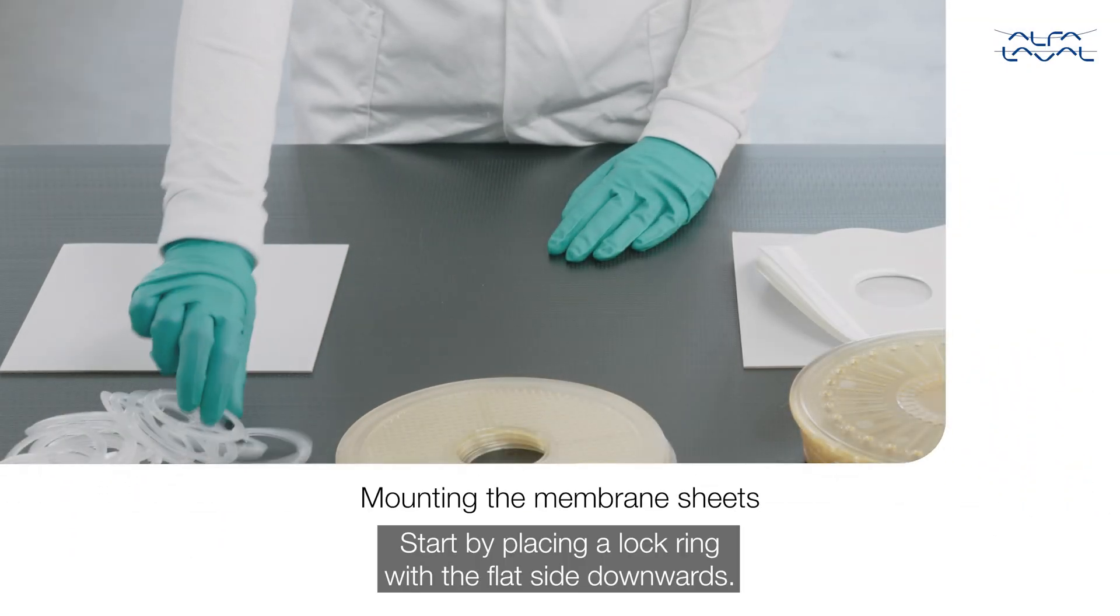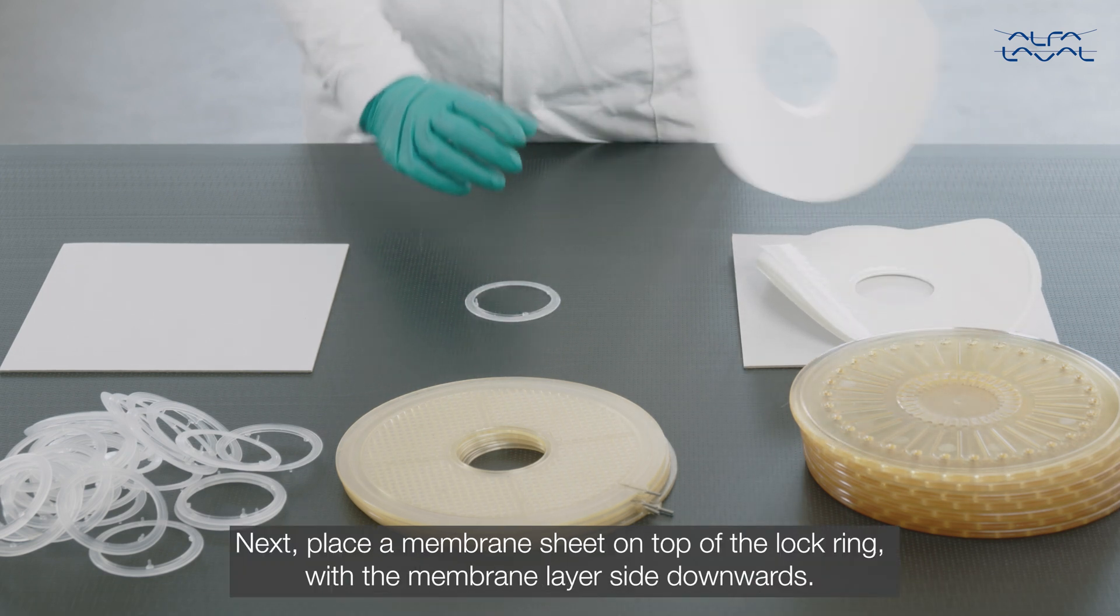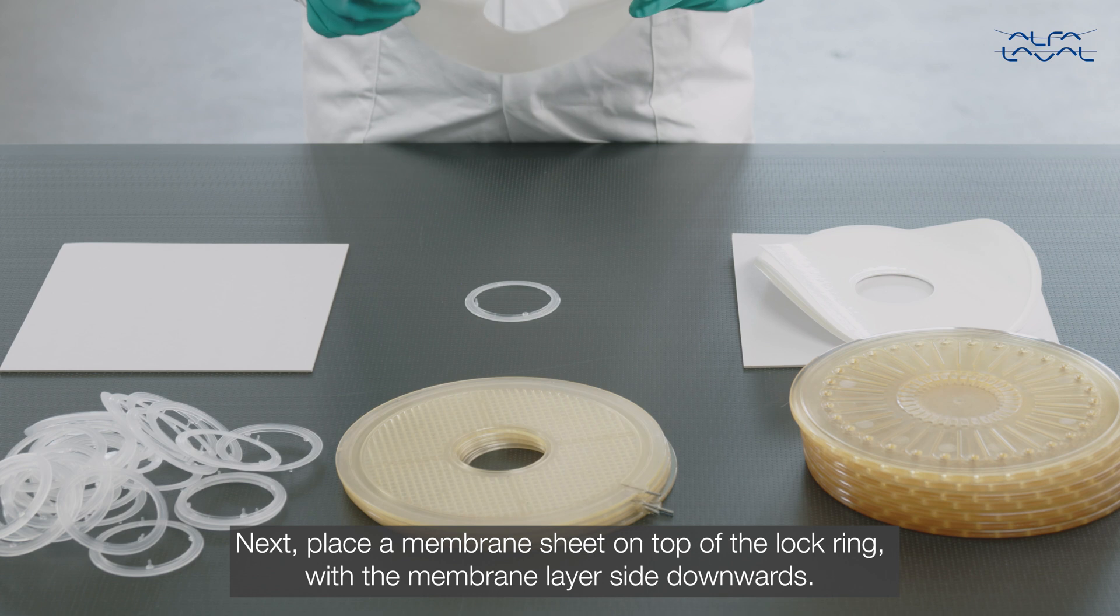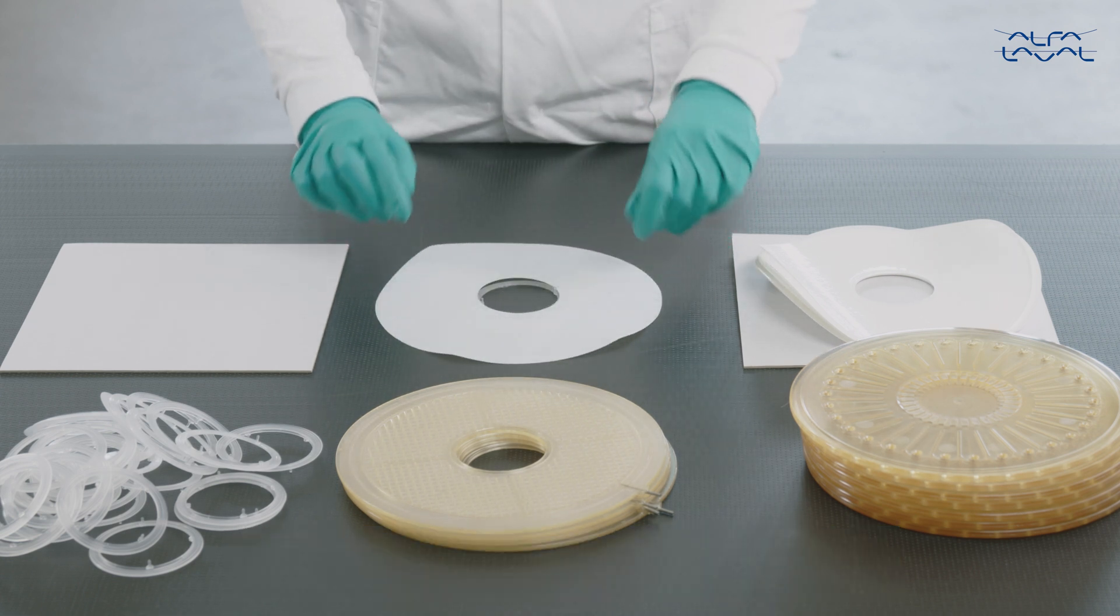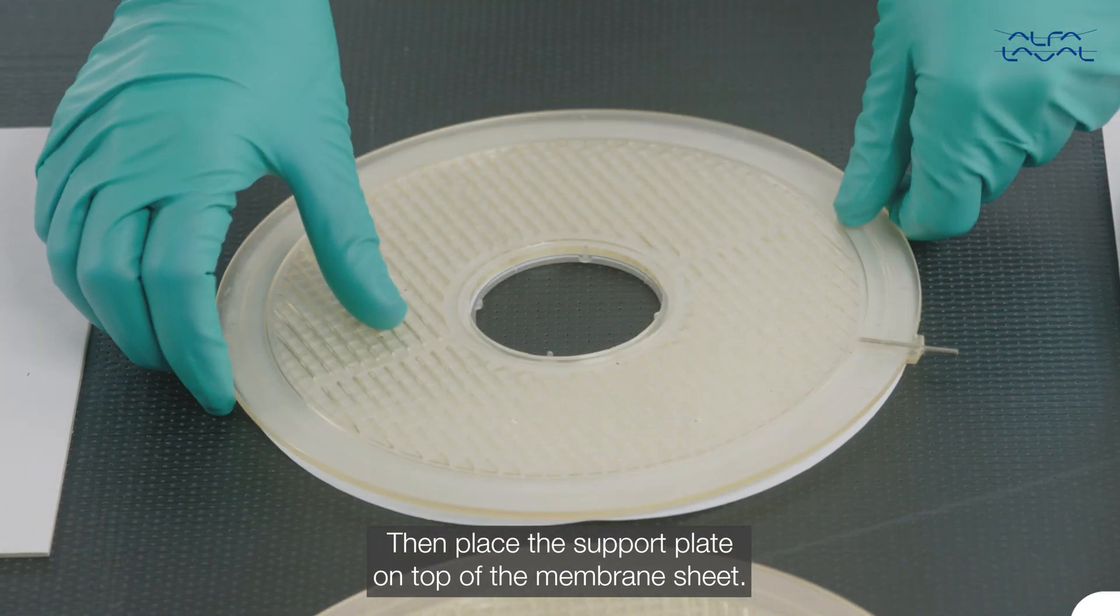Start by placing a lock ring with the flat side downwards. Next, place a membrane sheet on top of the lock ring with the membrane layer side downwards. Then place the support plate on top of the membrane sheet.